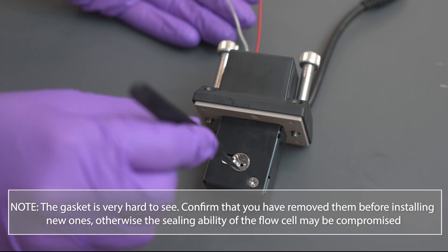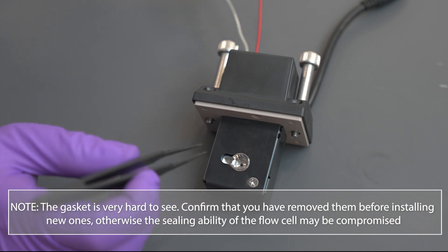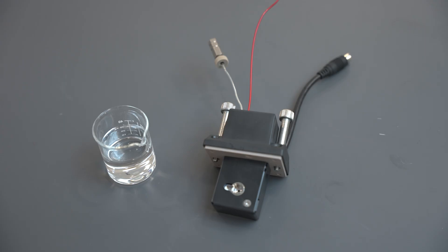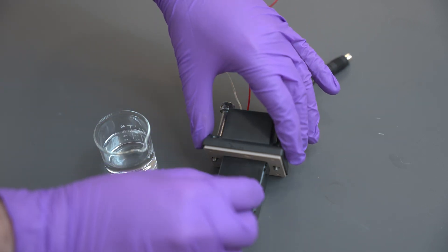The gasket is very hard to see. Confirm that you have removed them before installing new ones, otherwise the sealing ability of the flow cell may be compromised. Take a piece of wiping paper soaked in 2-propanol and wipe the inside of the flow cell where the lens and gasket sat.